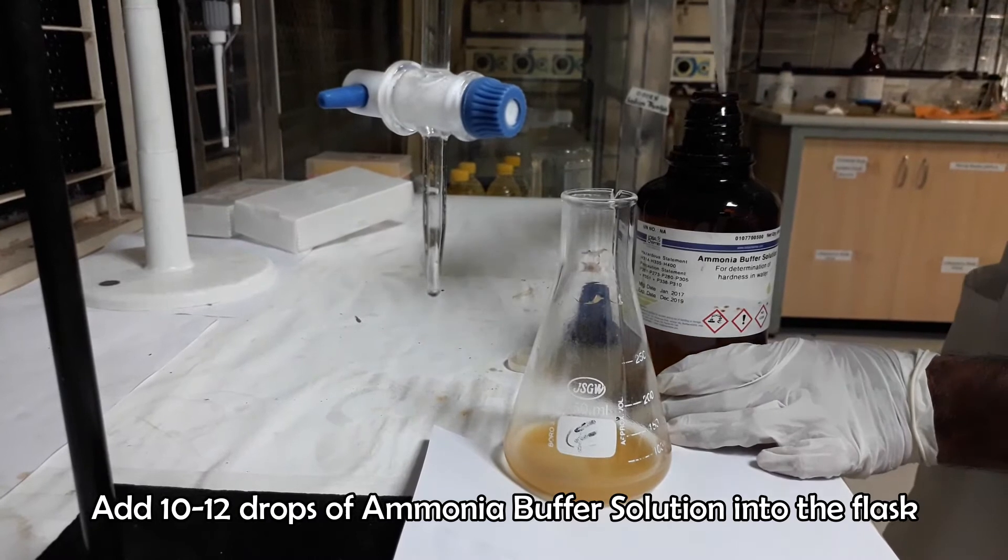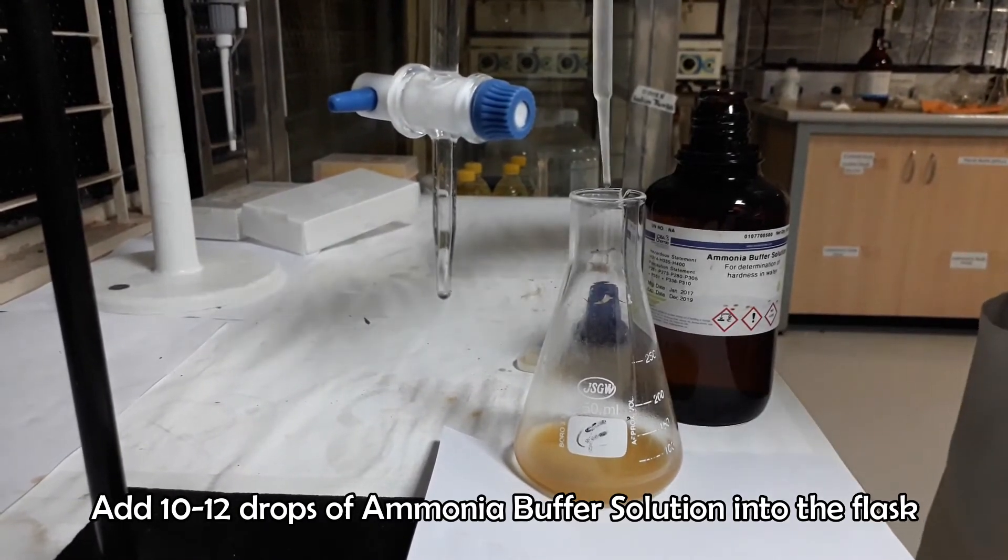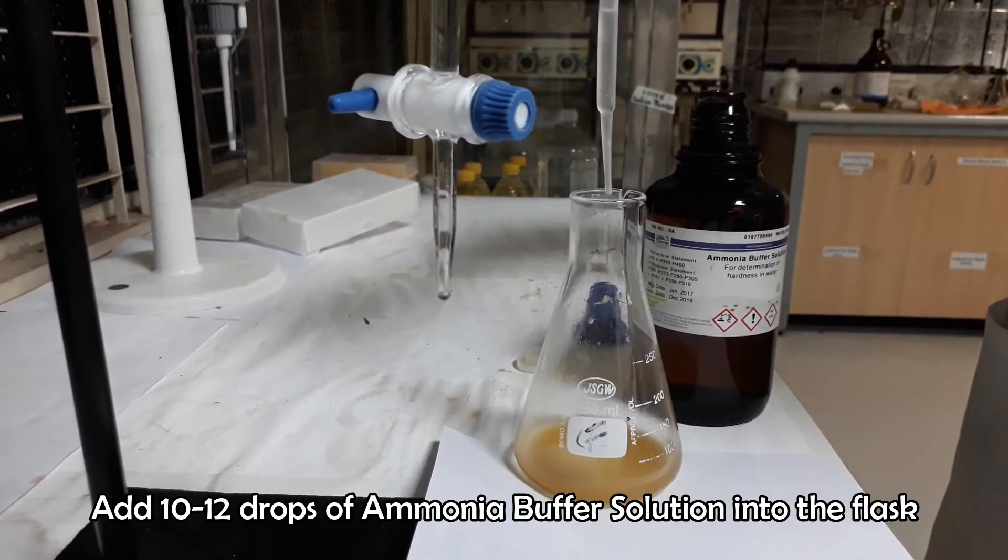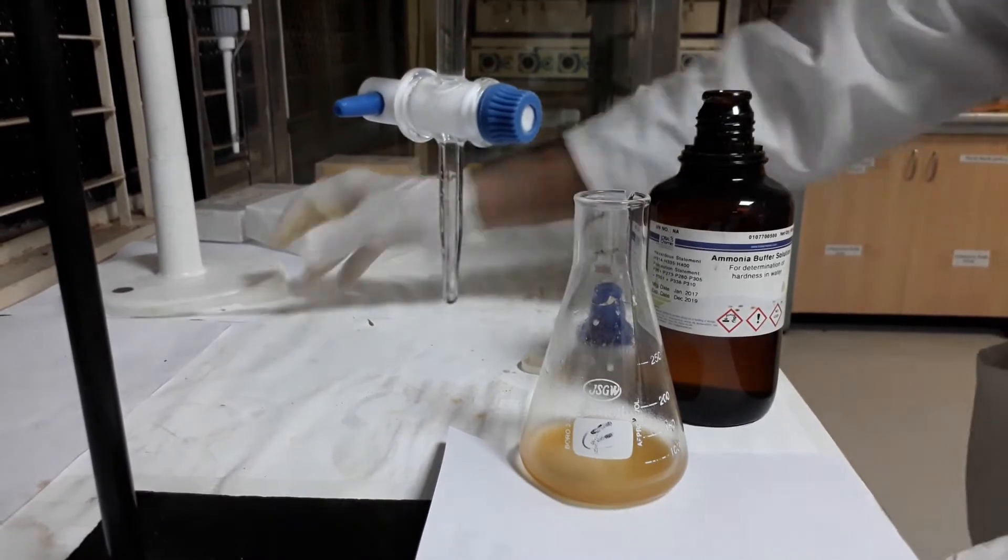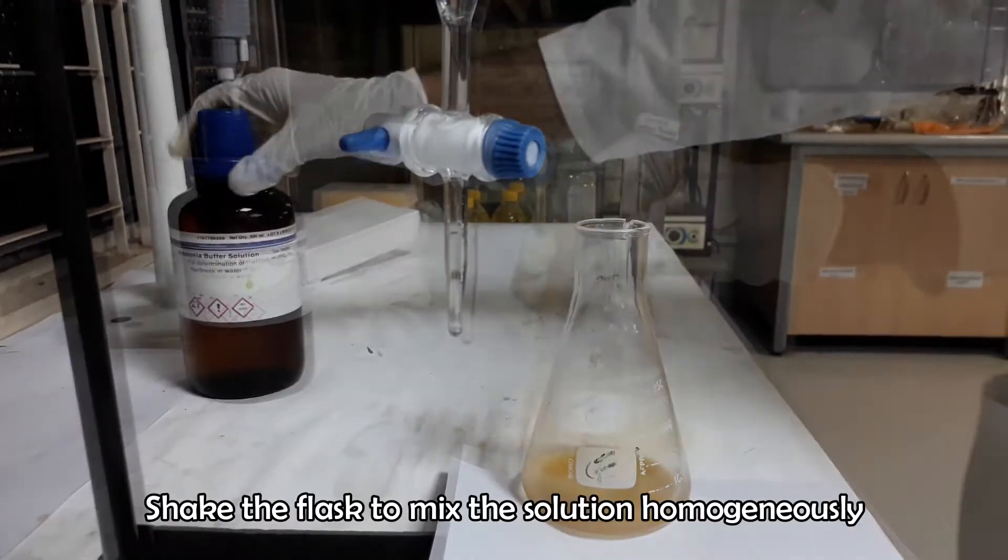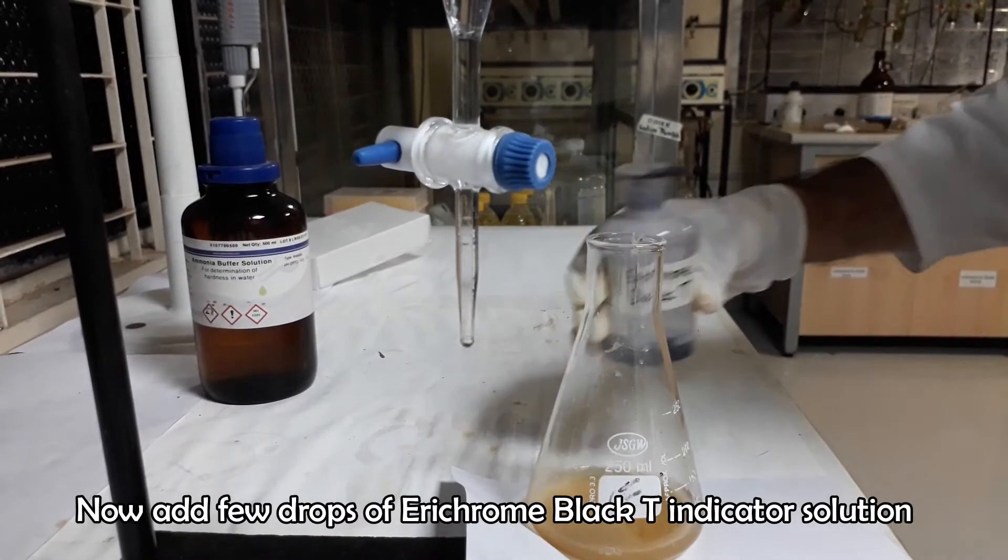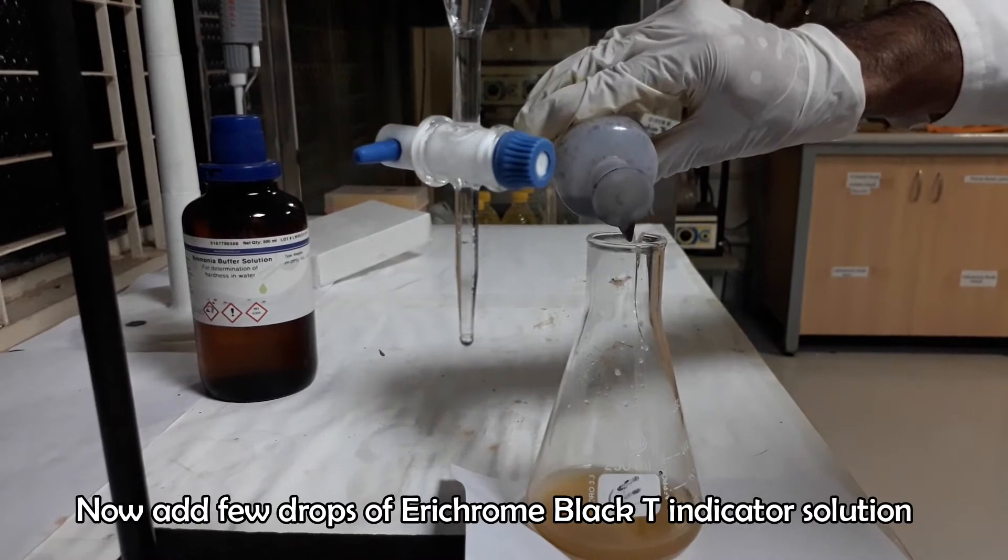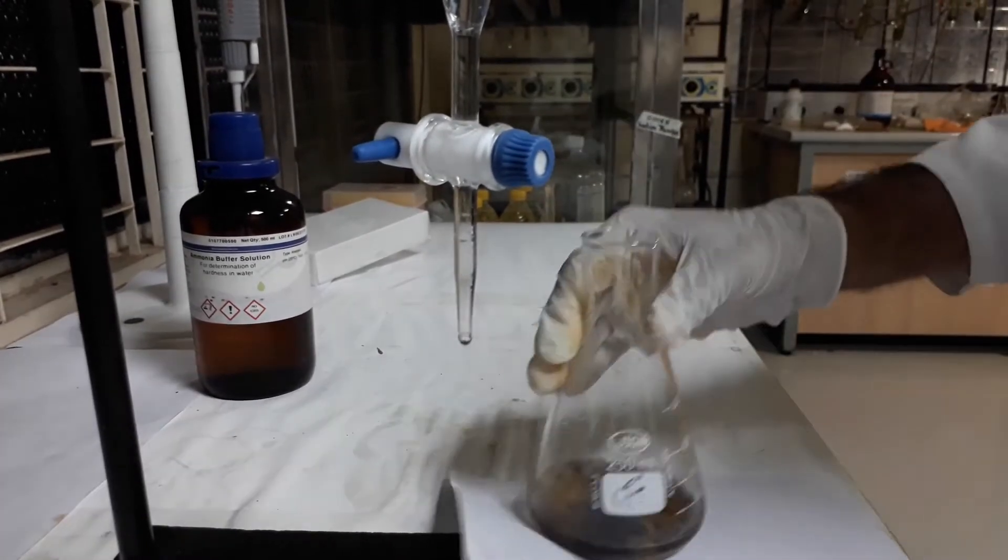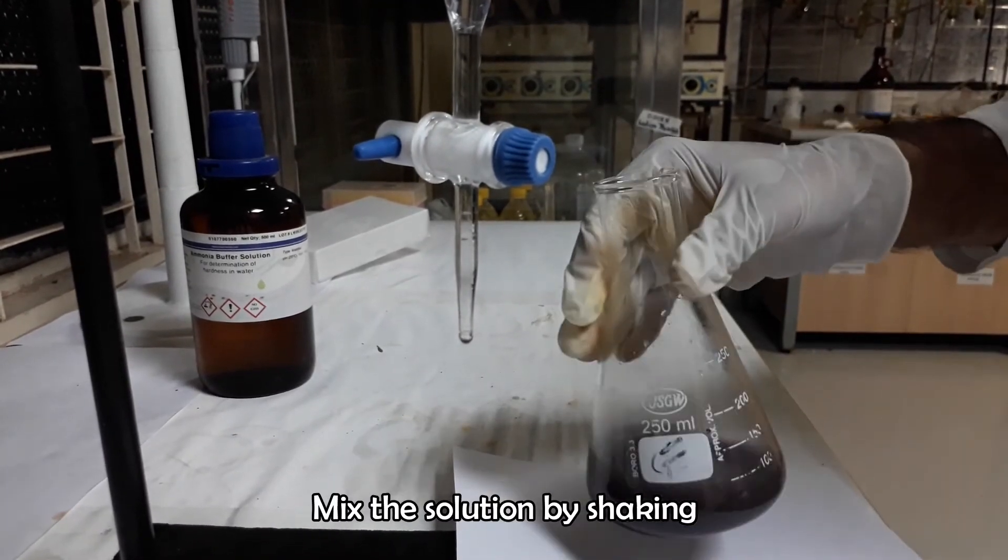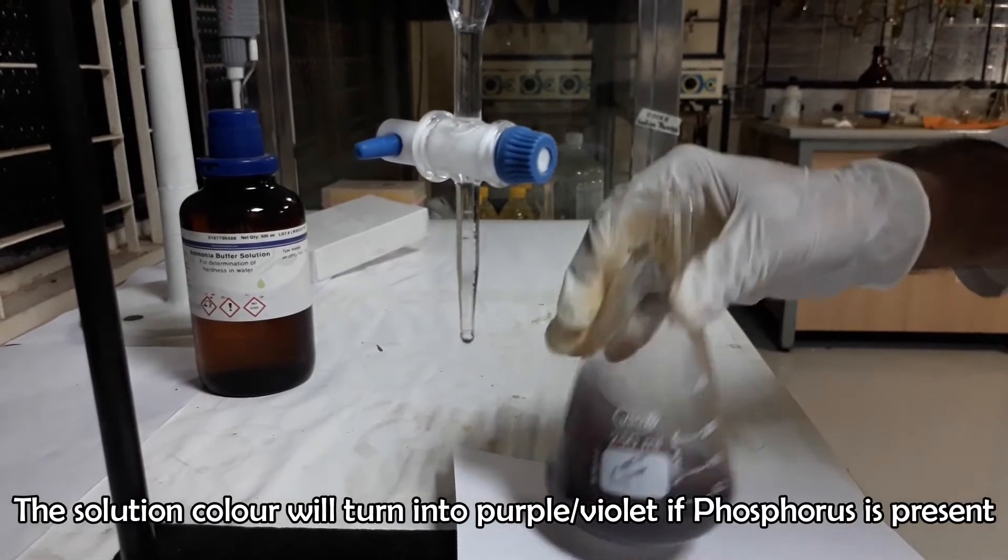Heat the mixture on hot plate for 4 minutes. Now add 10 to 12 drops of ammonia buffer solution into the flask. Shake and rotate the flask clockwise and anticlockwise to make a homogeneous mixture. Add a few drops of erichrome black tea indicator solution. The solution color will turn into purple or violet if phosphorus is present in the sample.